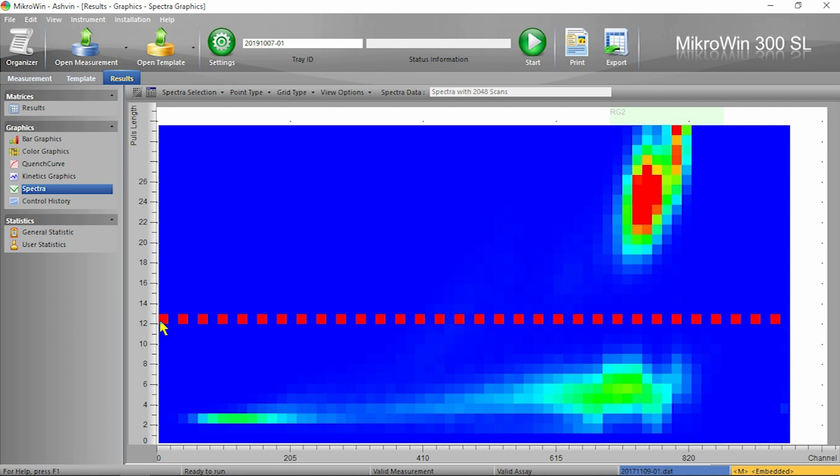Right now the line is set to 12, but this should be adjusted based on your cocktail. When using a dedicated alpha beta cocktail such as Hidex's Aqualite AB or Perkin Elmer's Ultima Gold AB, you can afford to have a higher PLI since the separation between the alphas and the betas is much greater.